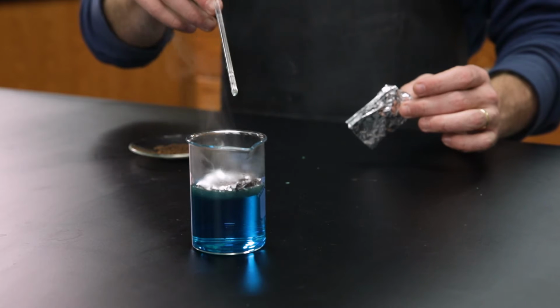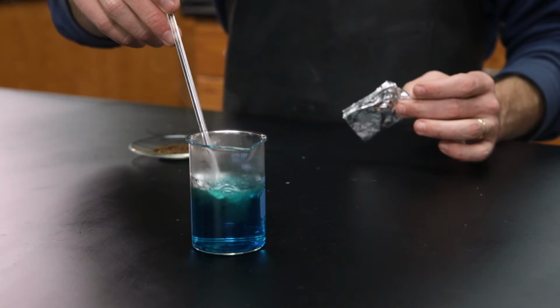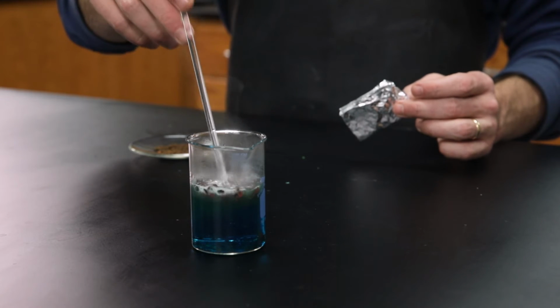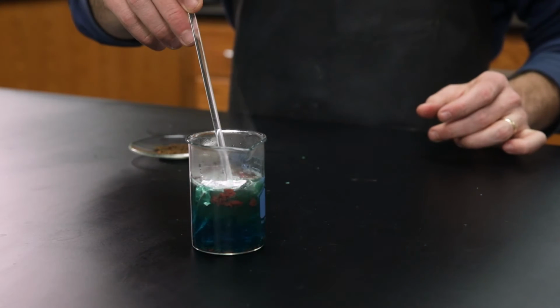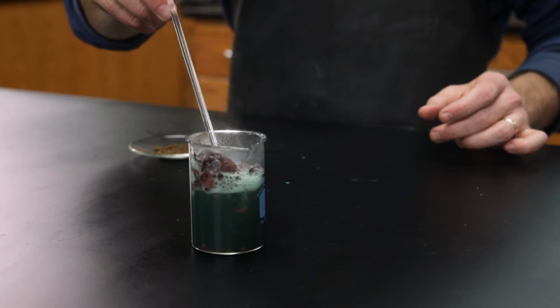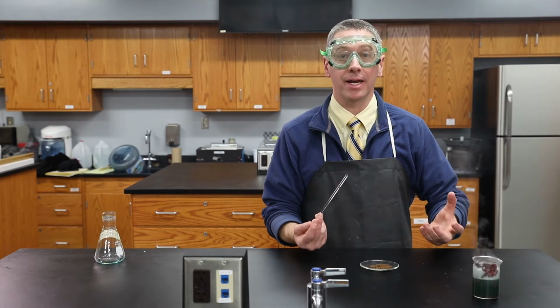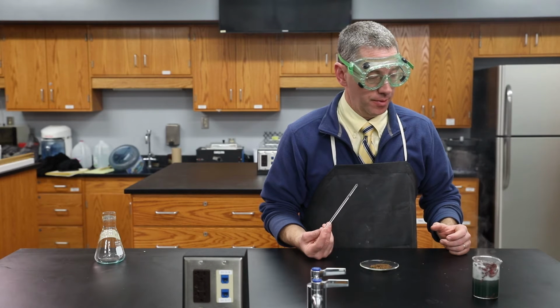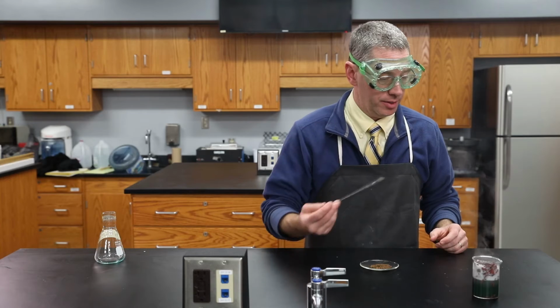If you look closely, you can see a brown color change. That's the copper being produced. We'll add the rest of the aluminum. Now this brown color that you see on the aluminum is actual metallic copper being produced because the aluminum is replacing the copper out of the copper chloride.